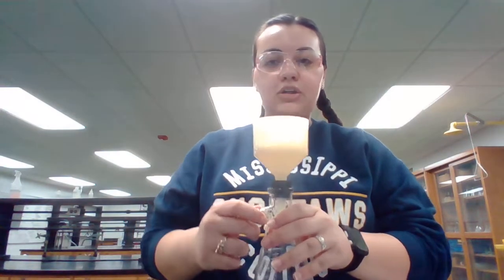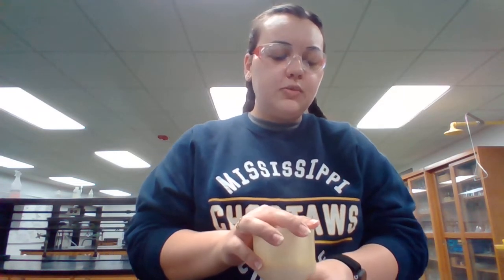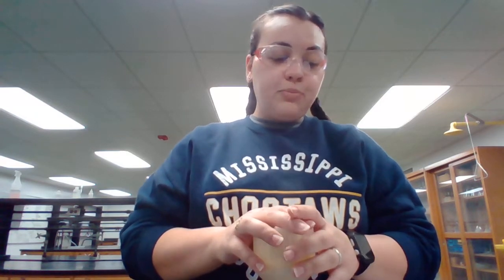Step 3 tells you to set up suction filtration. You did this last week, where you had a flask with a side arm, a large rubber hose, and then your Buchner funnel. So don't forget to cut your filter paper down to size. It will probably be much larger than your actual funnel. You can do it how I showed you last week or trace it however you prefer to do that.